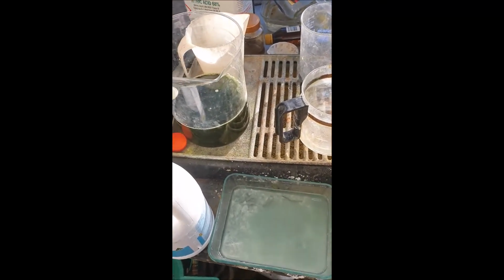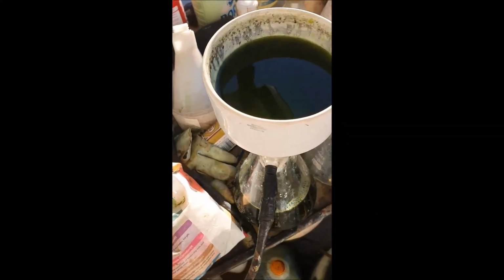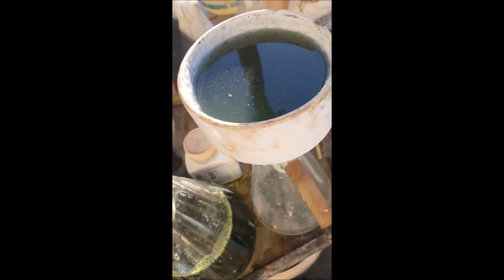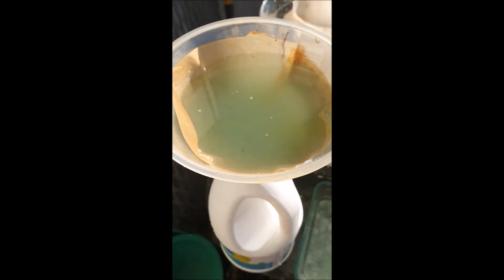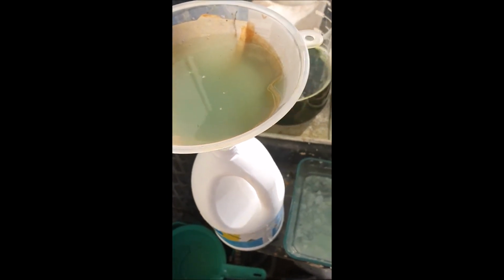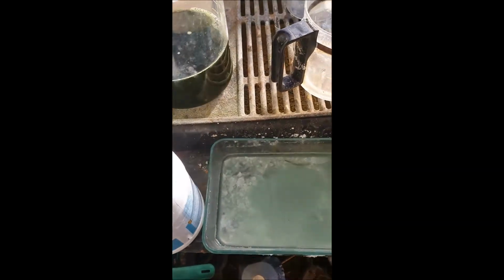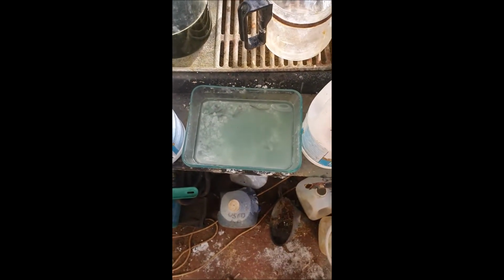So what's happening is I've got my AR there, and I've got a tiny bit more filtering in there, and in here I've got my copperas. Even though I originally stored some of the crystals in this container, I had forgotten that I had to filter it.